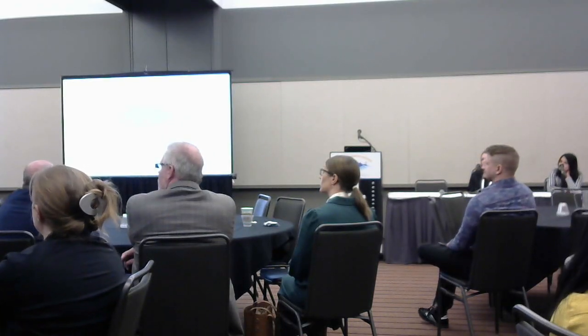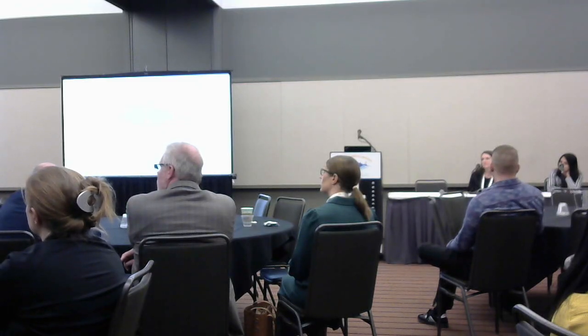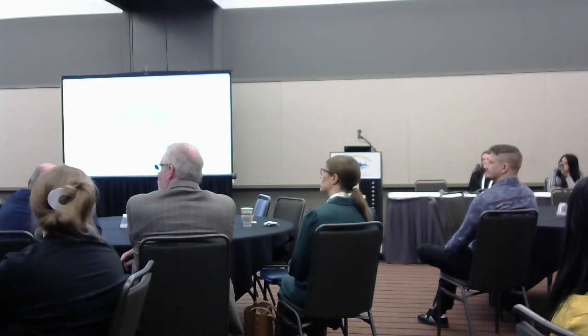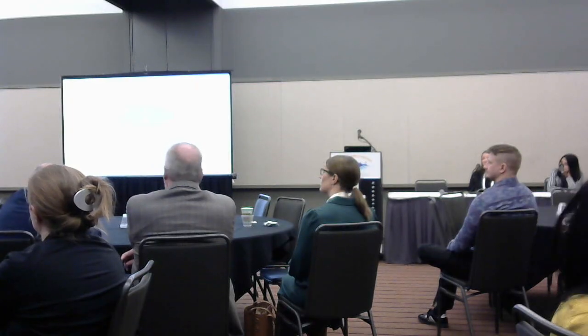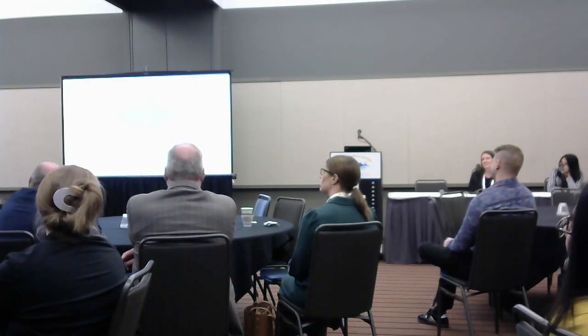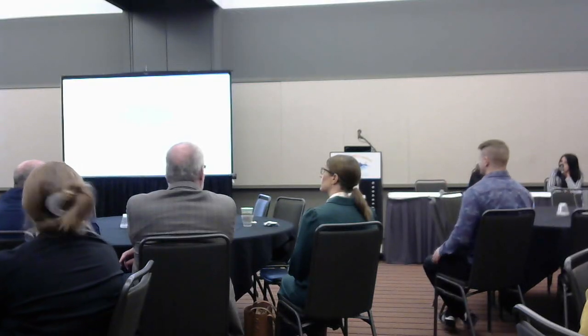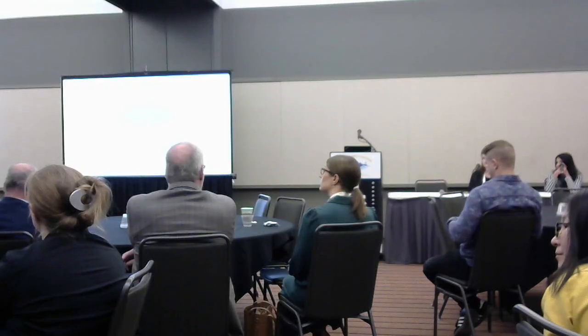I know part of the onus of getting the images analysis ready is on the facility, but also you train them and you leave them up to their devices. And then they bring you oversaturated images and they're like, oh, localize, stuff like that. So how do you handle that on that level? Do you have them consult with you before they set up the experiment, or do you communicate with the facility, and how does that work?